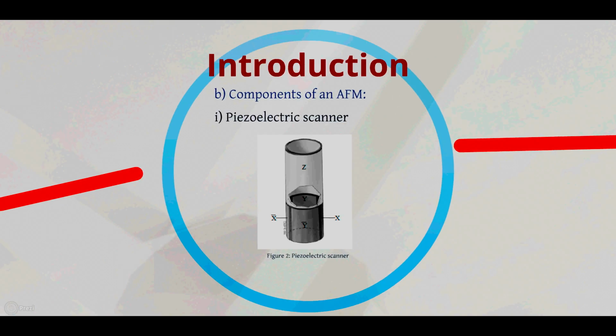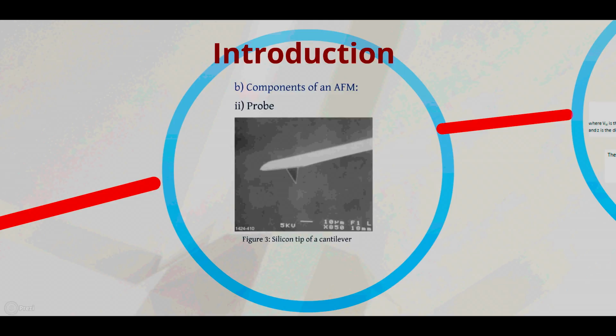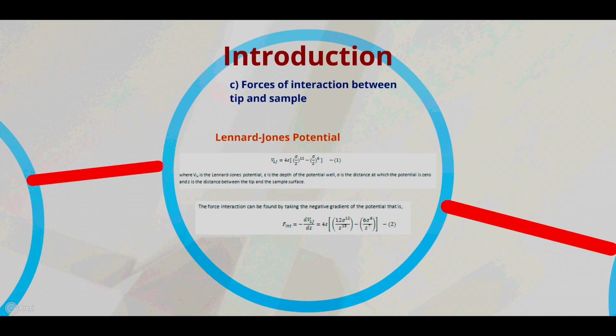This is how a piezoelectric scanner looks like. And this is how a scanning probe looks like imaged by an SEM. Next, I will move on to touch on the forces of interaction between the tip and sample.